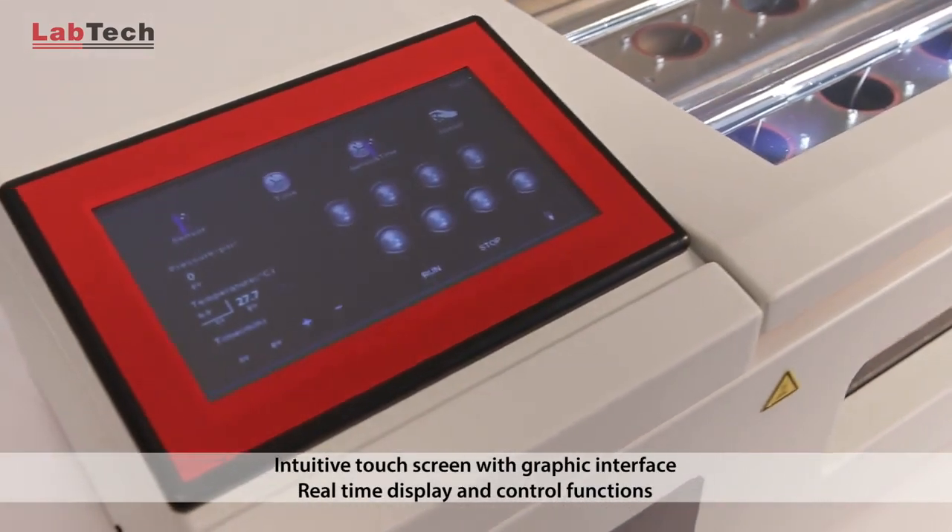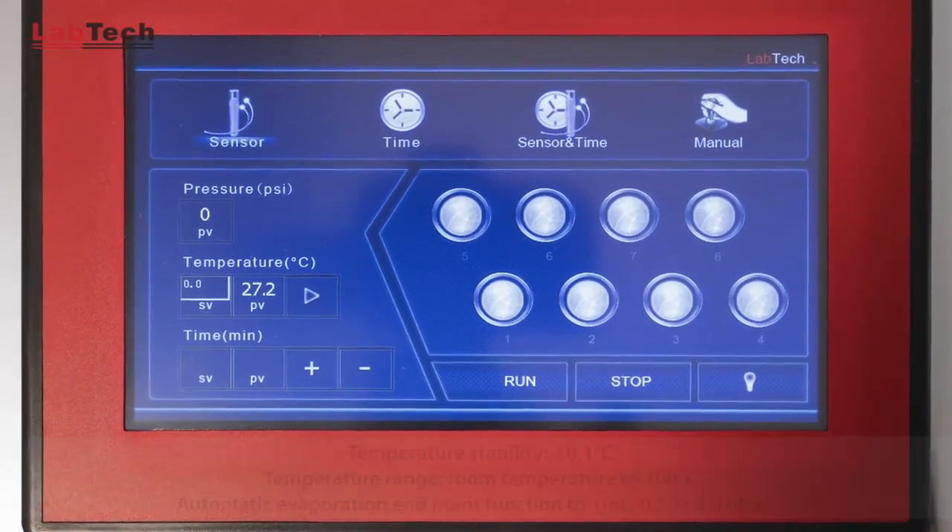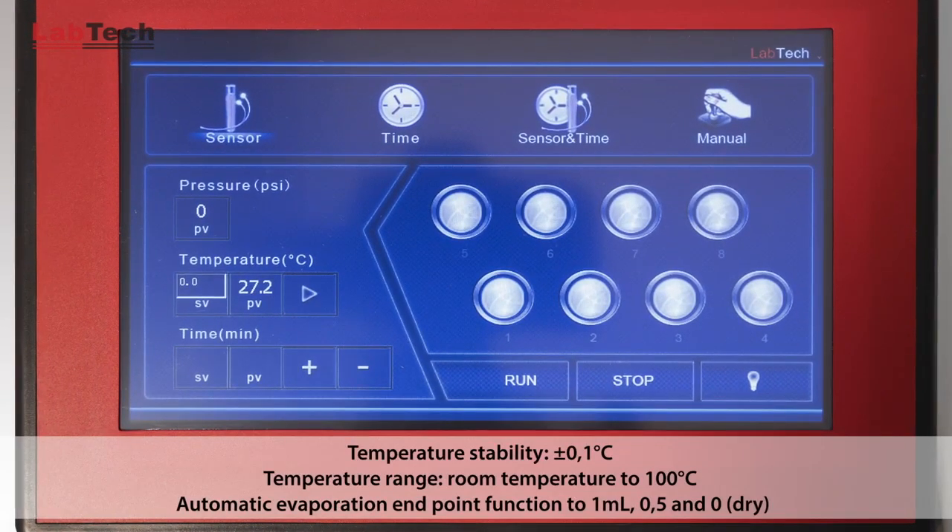Thanks to the intuitive touch screen with graphic interface, the operator can have a real-time instrument status and control functions.